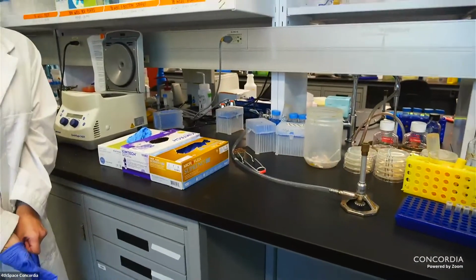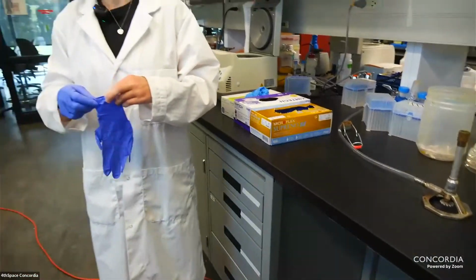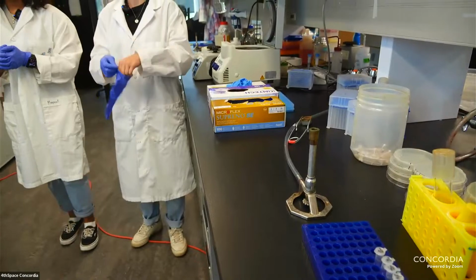Okay, if you guys want to all come around. We have small and medium gloves here. Everyone please glove up.